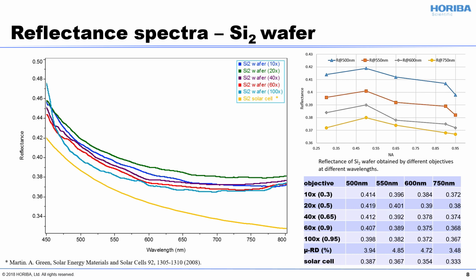However, the different numerical aperture of the objective doesn't have very different performance on the silicon sample surface. Which is expected because it's a specular sample surface. We expect that all the reflection can be collected by our objective.